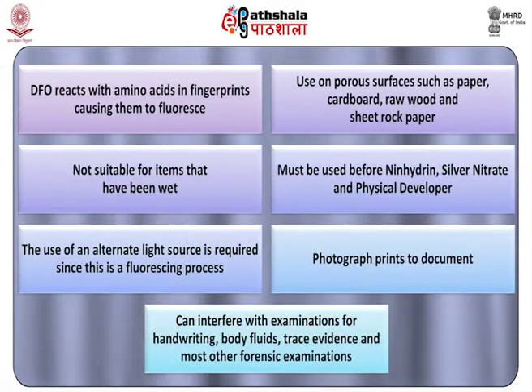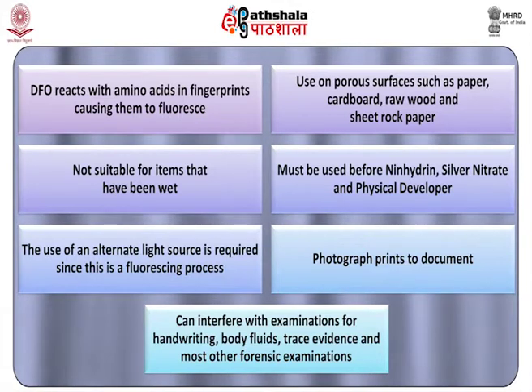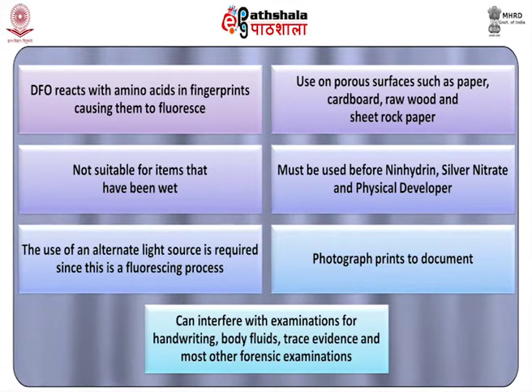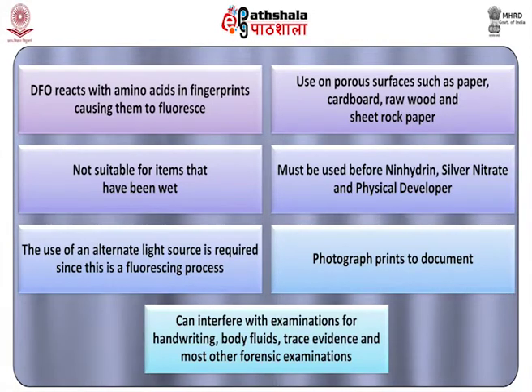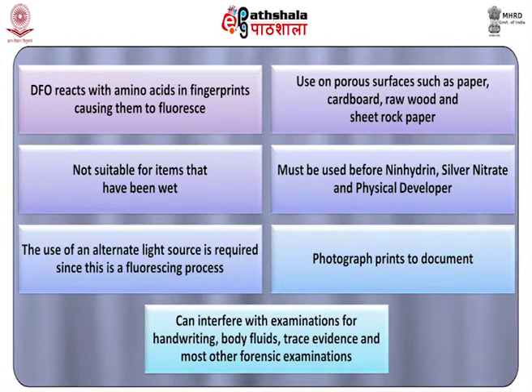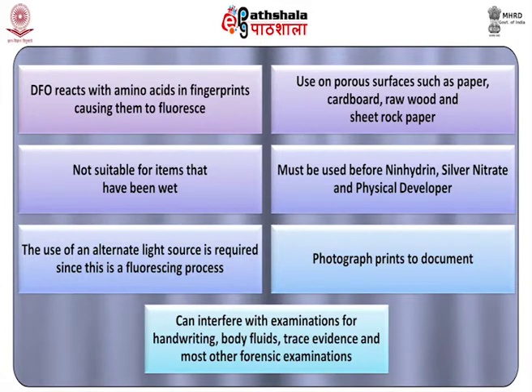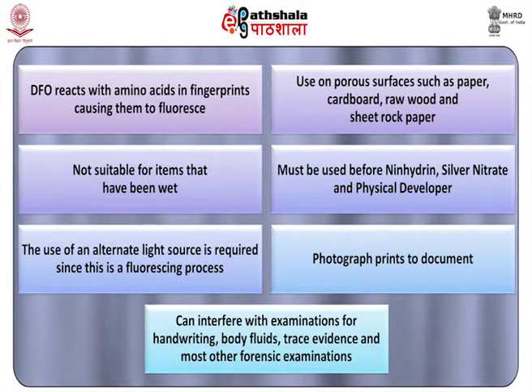DFO reacts with amino acids in fingerprints, causing them to fluoresce. Use on porous surfaces such as paper, cardboard, raw wood, and sheetrock paper. Not suitable for items that have been wet. Must be used before ninhydrin, silver nitrate, and physical developer.